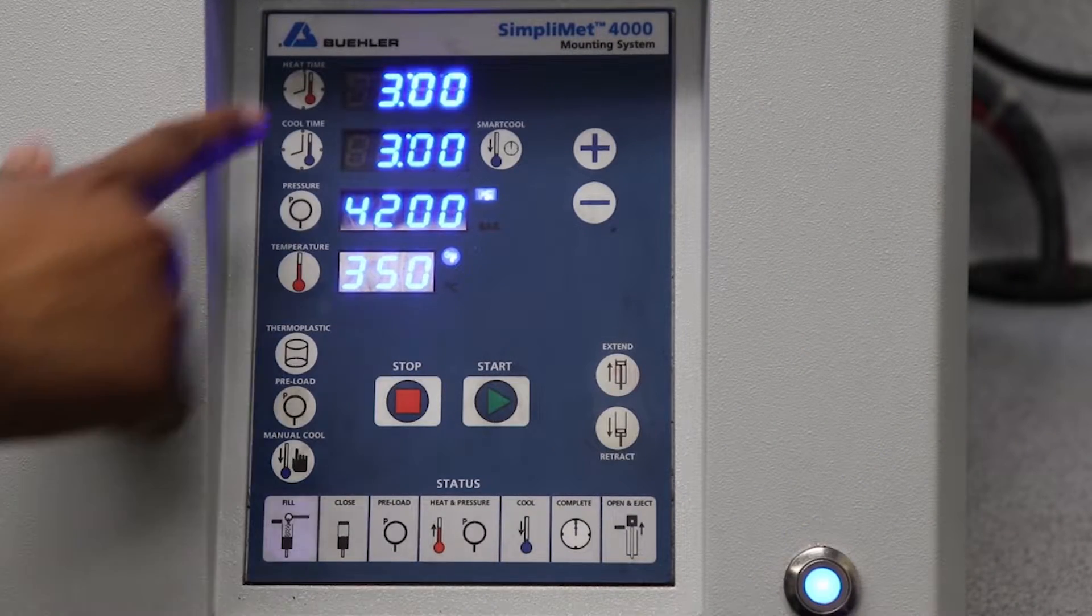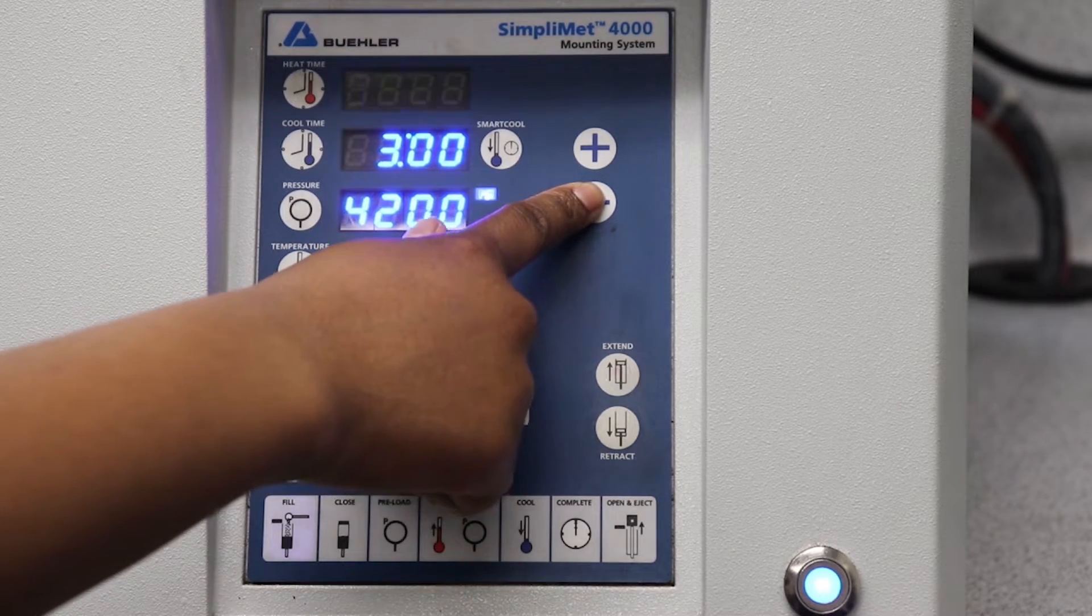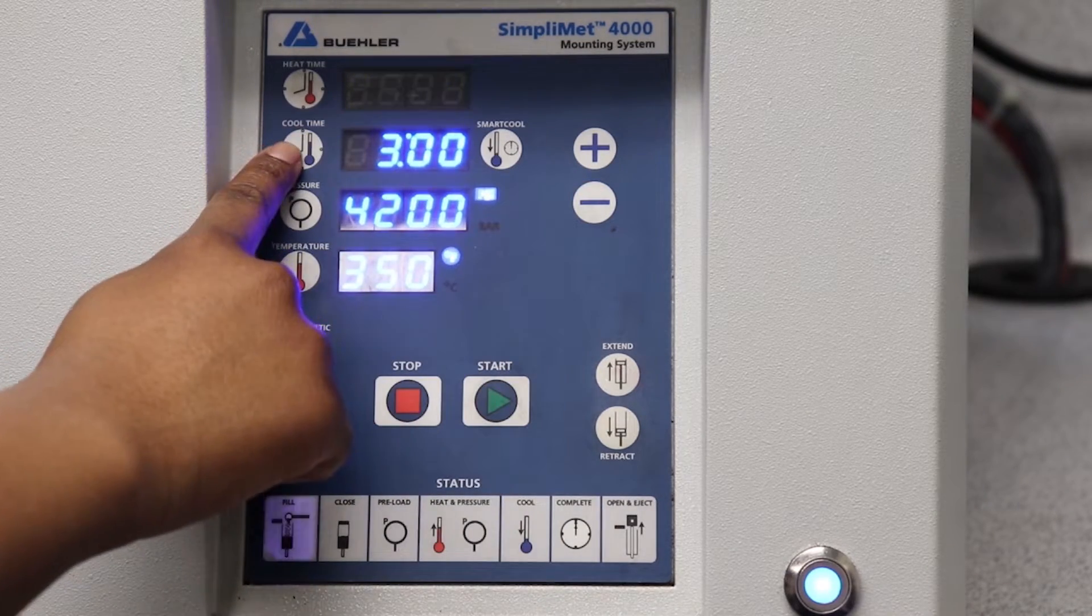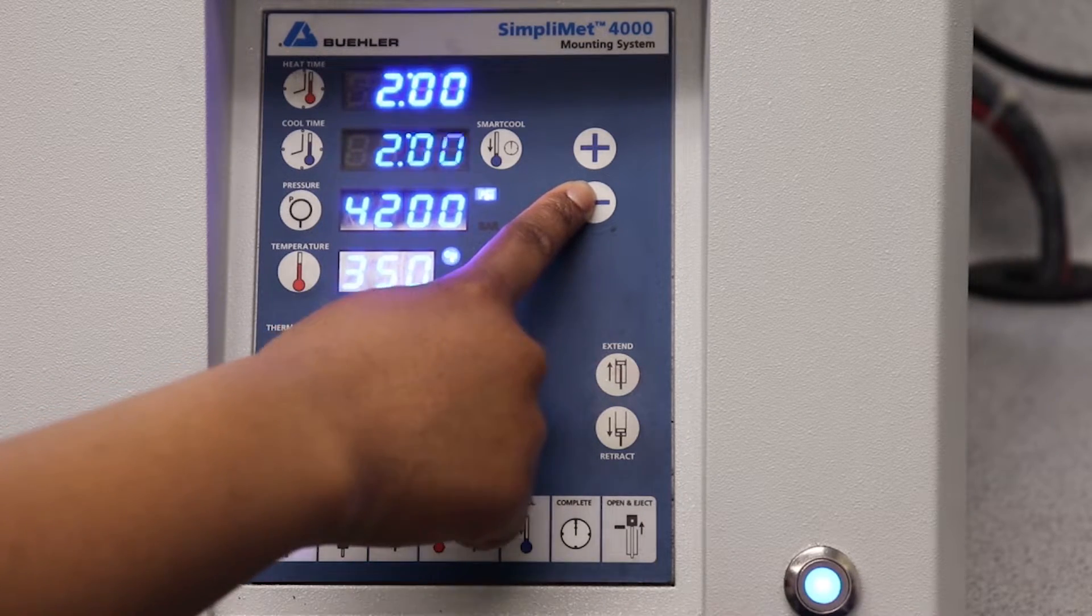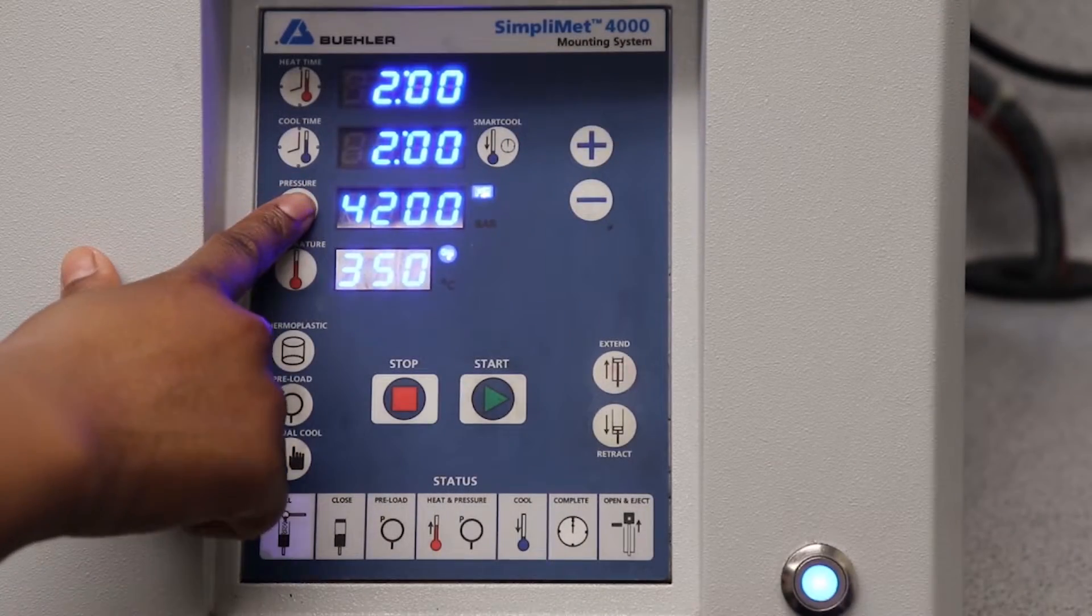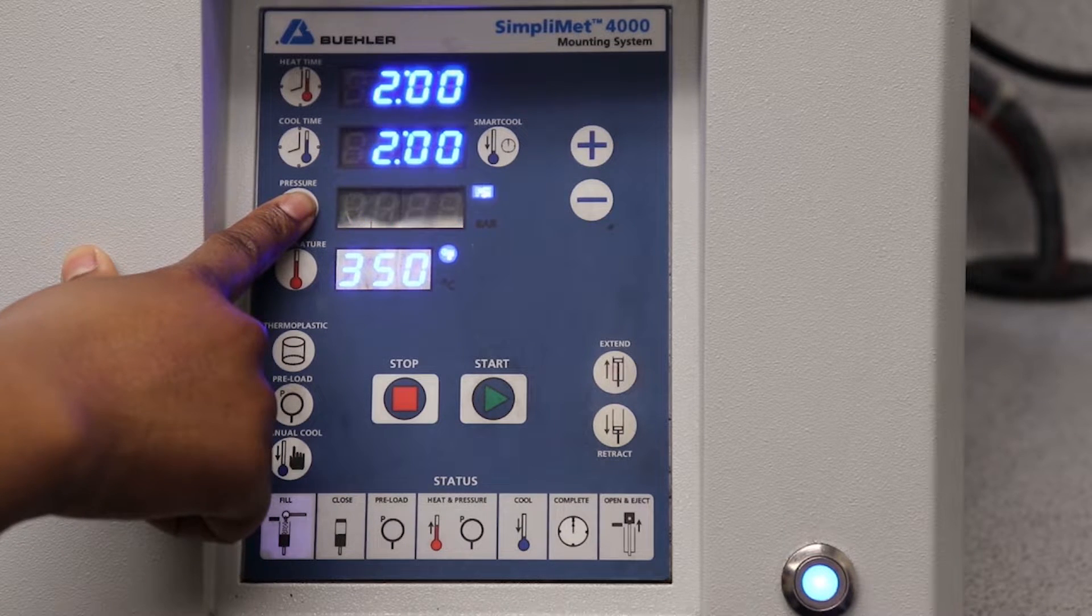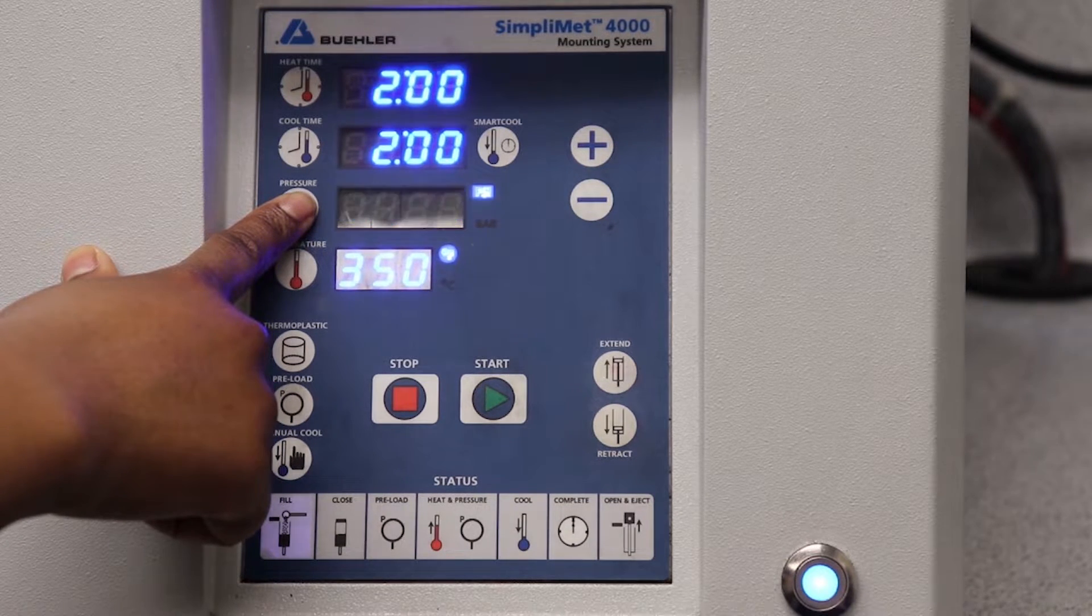Next, change the setting to the appropriate values for the media and mount size being used. This can be done by pressing the icons to the left of the values and then pressing the plus and minus buttons to adjust the values accordingly. The pressure and temperature units can be switched by pressing and holding the button to the left hand side of the number display.